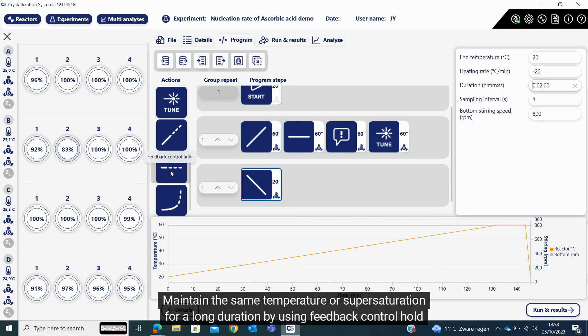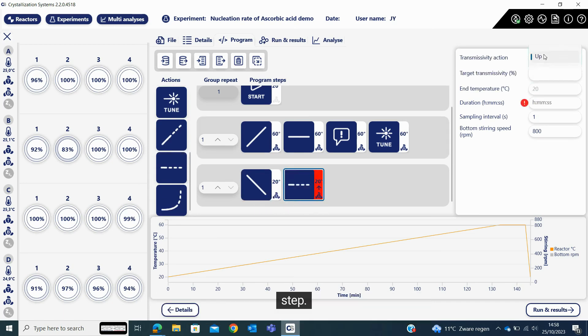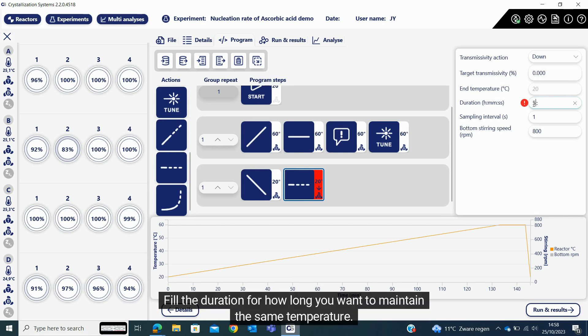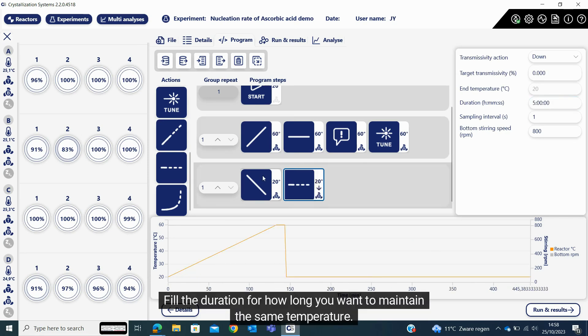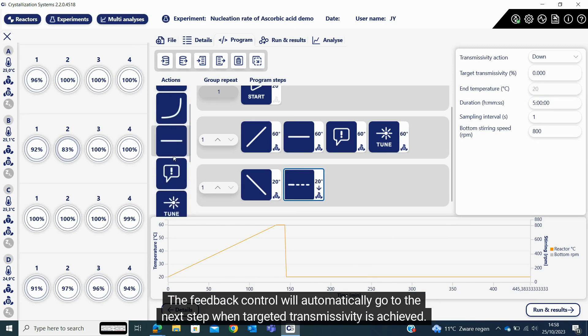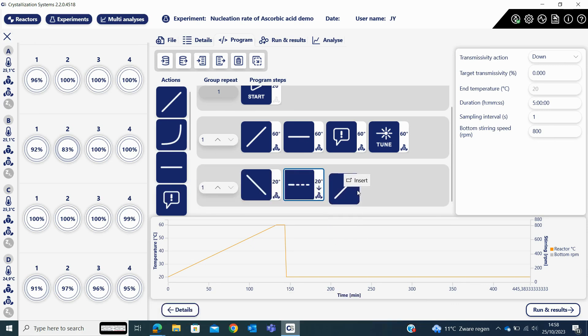Maintain the same temperature or supersaturation for a long duration by using feedback control hold step. Mention if the transmissivity is going up or down and the targeted transmissivity. Fill the duration for how long you want to maintain the same temperature. The feedback control will automatically go to the next step when targeted transmissivity is achieved.